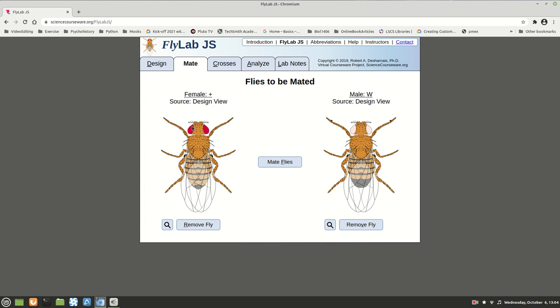So we have big W, big W crossed with white, which we consider little w, little w — ignore the fact that the program shows a capital here. And now I'm going to mate these flies.